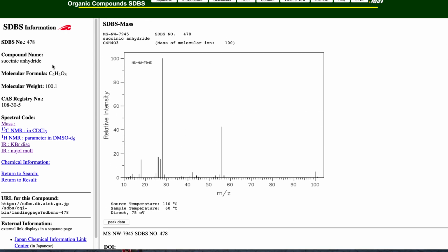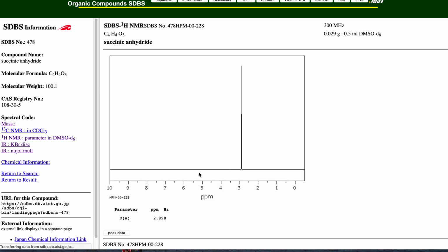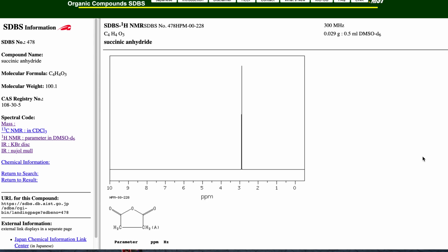Okay. Then hydrogen proton NMR run in DMSO-d6 solvent. So I clicked on that. Simple enough. Wait till you see some of them. But that's your proton. Hydrogen. We call it proton, but we don't mean plus. We simply mean hydrogen. Not deuterium or tritium isotopes, just good old-fashioned hydrogen. And that is your hydrogen NMR. And that runs from 0 to 10 parts per million. And we'll talk about that in week number 5.